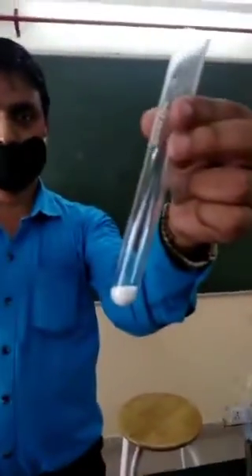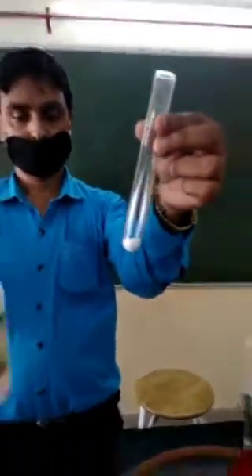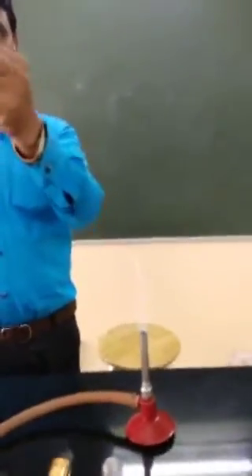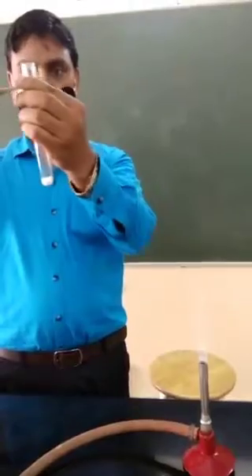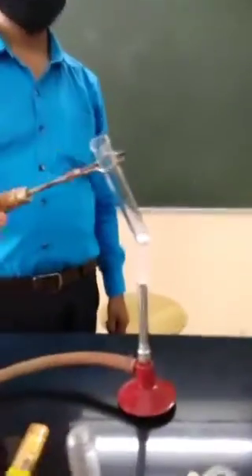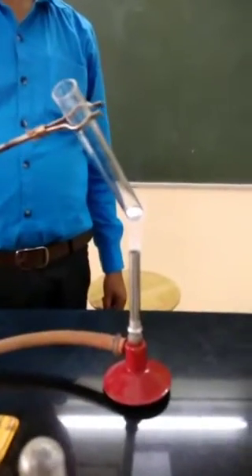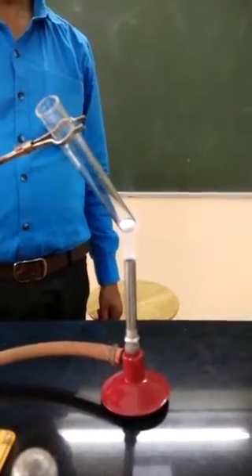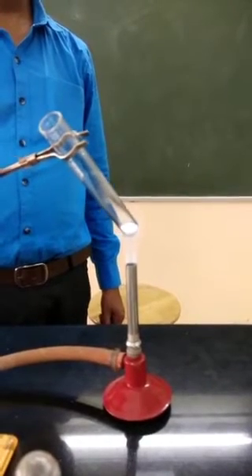Children, this is zinc carbonate. Take a small amount of zinc carbonate in a test tube. Zinc carbonate is a light amorphous white colored solid. Now we will see the effect of heating on this compound.